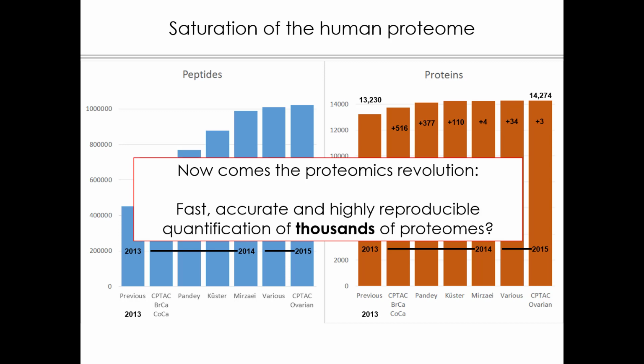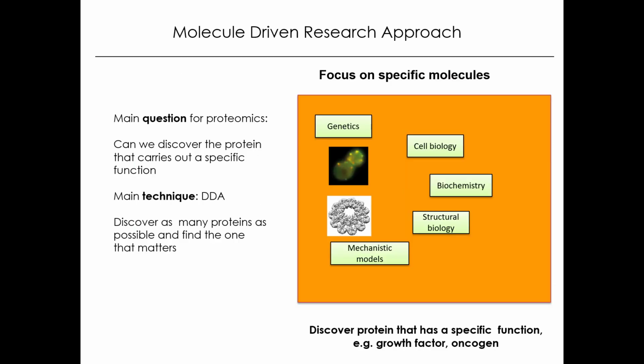So I would think that we can claim this proteomics revolution is happening because the techniques are quite mature and certainly of a reasonable, actually quite high, throughput, but they're not able to cover the whole proteome. This is something that we should keep in mind. But it is possible now to cover hundreds, if not 1,000 proteomes through these DIA techniques in very high throughput and with relatively good reproducibility and quantitative accuracy.